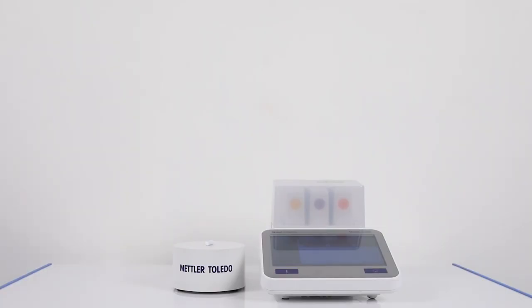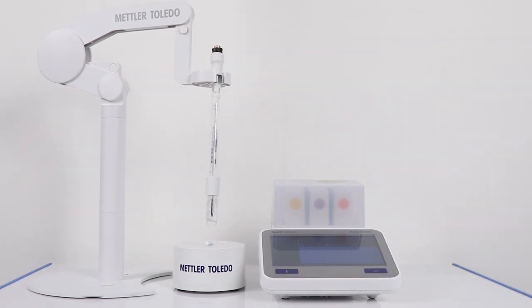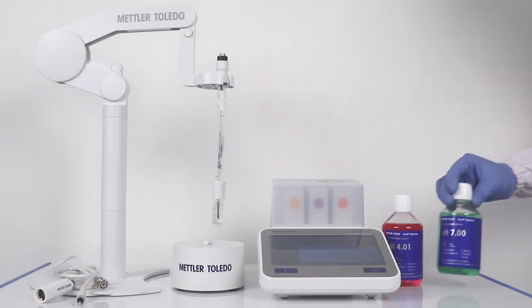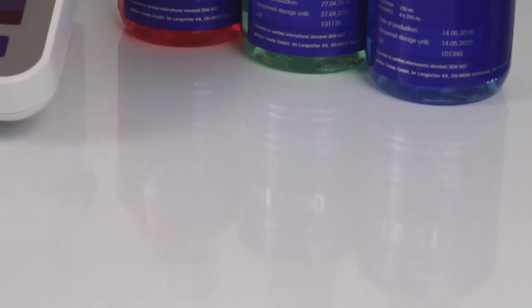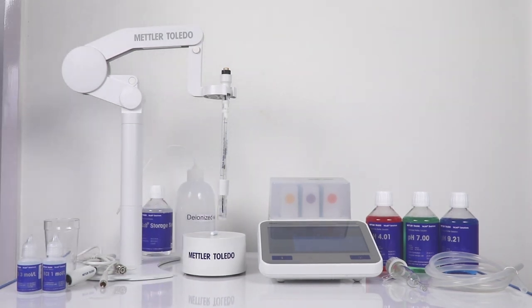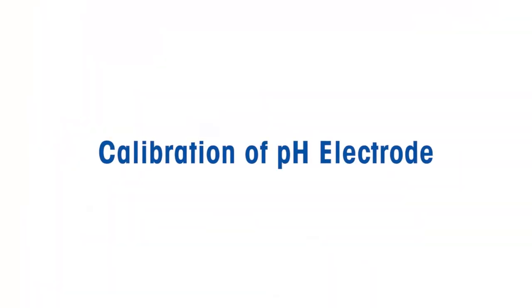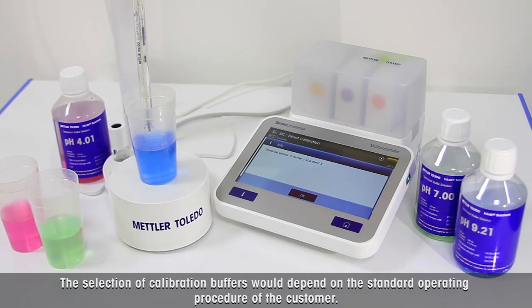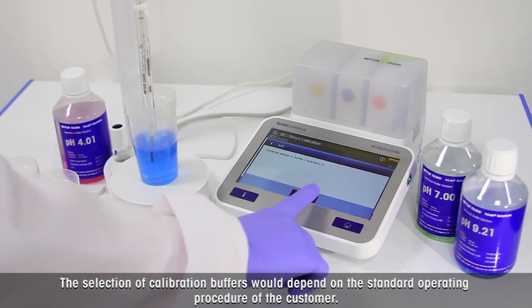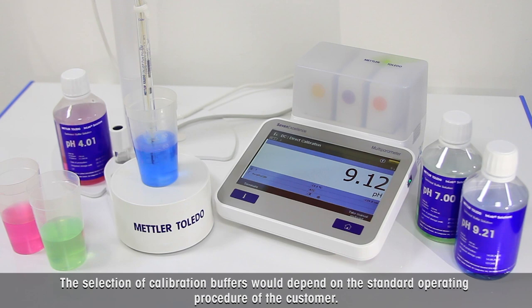Now we will see the calibration of the pH electrode and pH measurement in deionized water. For pH measurement in pure water, you need a pH meter with a uMix magnetic stirrer, an electrode holder, the InLab Pure Pro ISM sensor, a multi-pin cable, buffer solutions, glass beakers for samples, a flow cell, and maintenance solutions. Calibration and measurements are carried out using automatic endpoint type and standard endpoint criterion. Use an electrode calibrated with standard buffer solutions pH 4.01, pH 7.00, and pH 9.21, bracketing the expected measurement value.